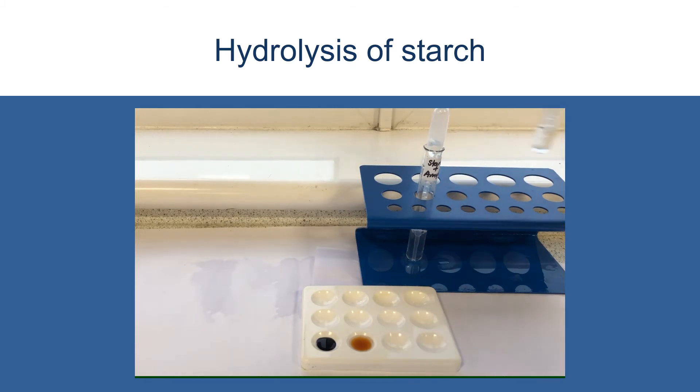What you can then do is you can add some Benedict's reagent to each of these test tubes.